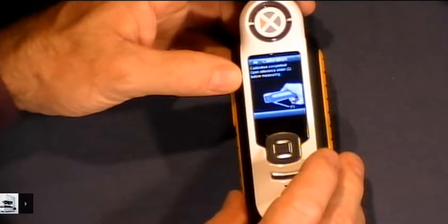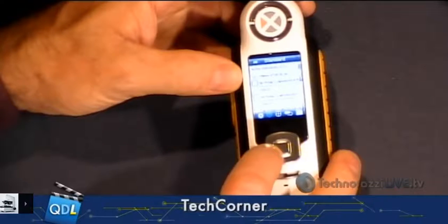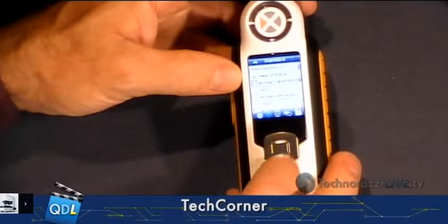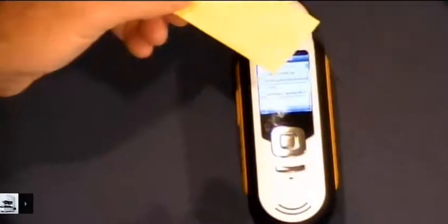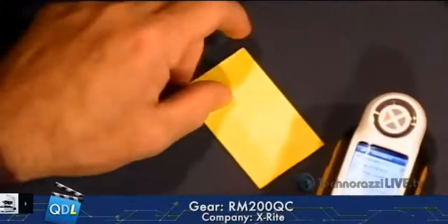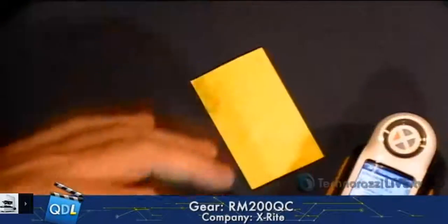Good to go, and we can start taking measurements. Now, what we're going to do first is record our standard. So I'm going to create a standard right from scratch, show you how easy it is. Just happen to have a yellow Post-it note, so that is going to be our standard. Post-it note yellow is going to be our standard.